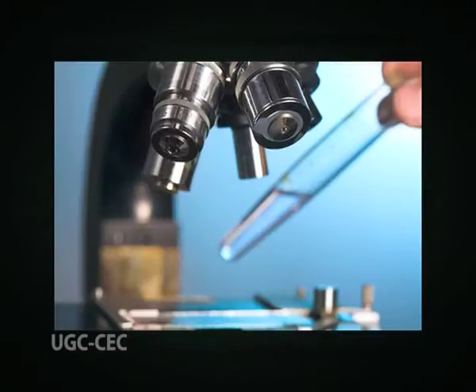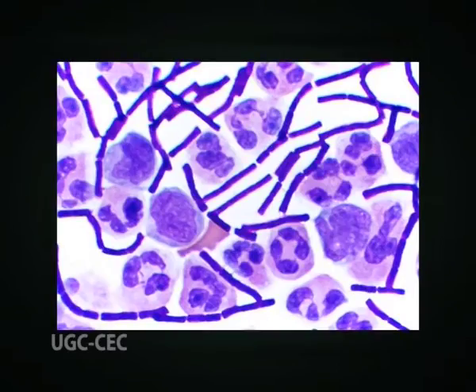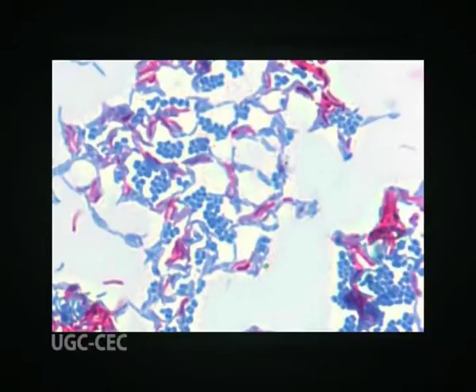Light microscopy exists with a variety of modifications such as microscopy with transmitted light in the visible spectrum that works with samples prepared by specific or basic staining to differentiate the individual internal structure. The common staining is basically used to enhance all structures present in the final product, which are then identified by their morphological characteristics such as shape, size and the mutual cell configuration, the presence of crystals, grains, etc. However, special staining ensures highlighting the selected structure with a different color than other parts of the product.